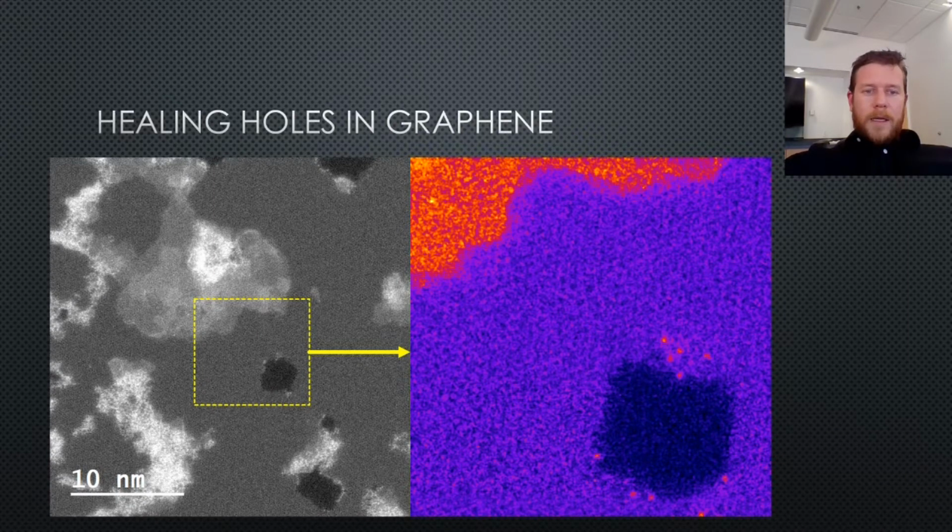And then this, I think, is the final example. This was not on a heater chip, but we've seen that with the heater chip we can possibly control how much hydrocarbon deposition there is. In this sample, it was mostly pretty good, but in this particular area, for some reason, I was getting a very, very slight amount of hydrocarbon deposition.